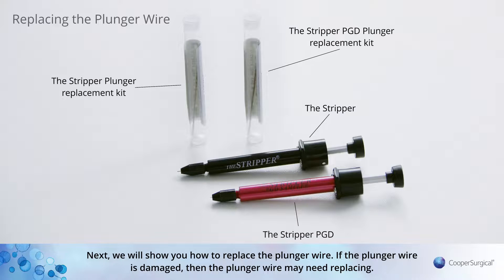Next, we will show you how to replace the plunger wire. If the plunger wire is damaged, then the plunger wire may need replacing.